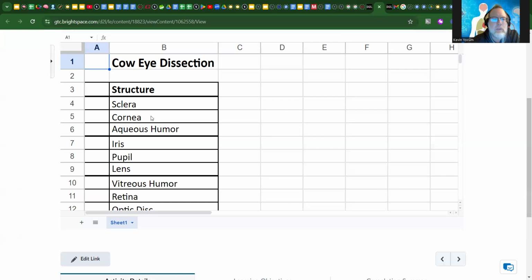Now, we're going to make an incision through the cornea to empty out the aqueous humor. Okay, and then after we do all of that, we're going to come around and make an incision and cut the eyeball, not in half per se, but more or less maybe 65-35, or a third. Remember, the front room is smaller than the back room, so we want to separate the two rooms.